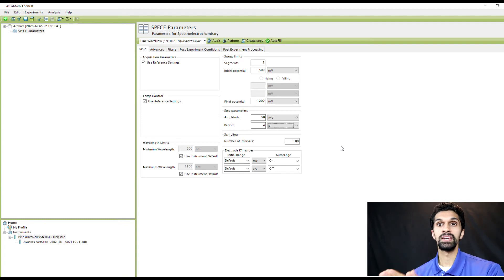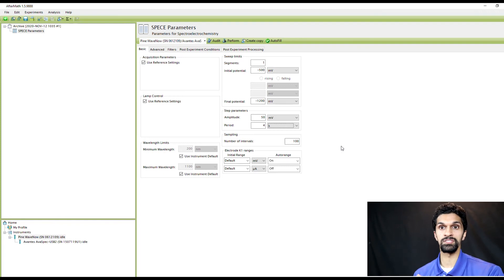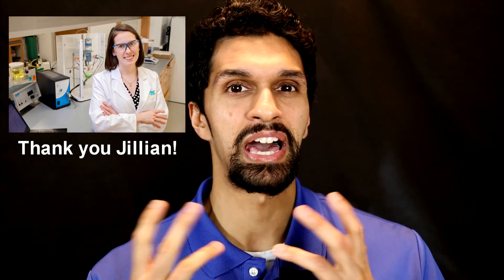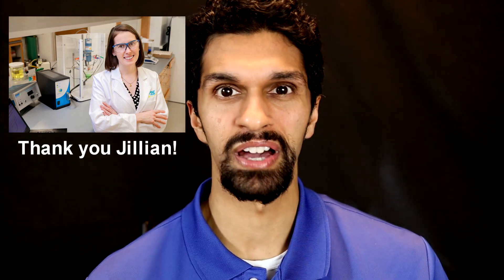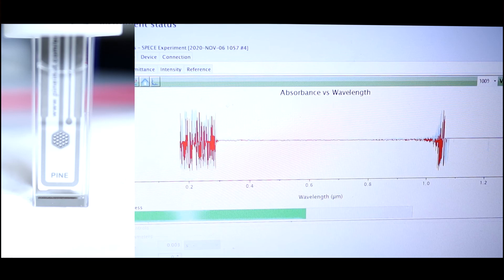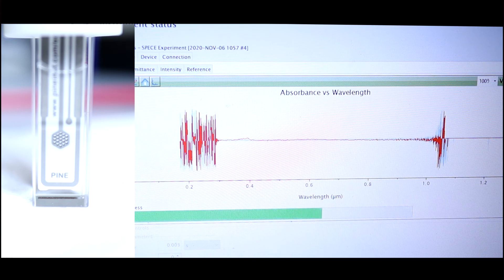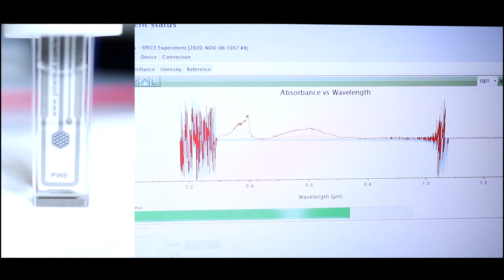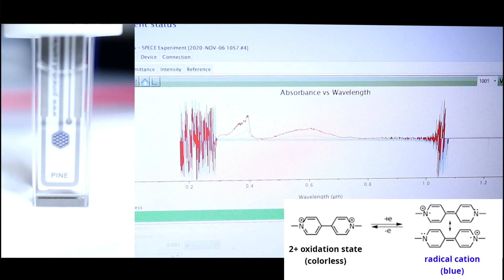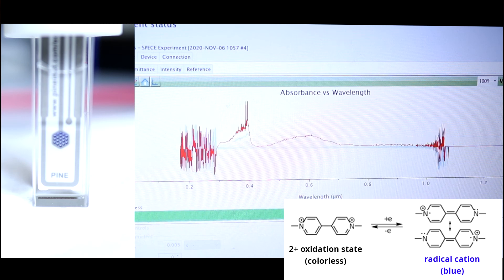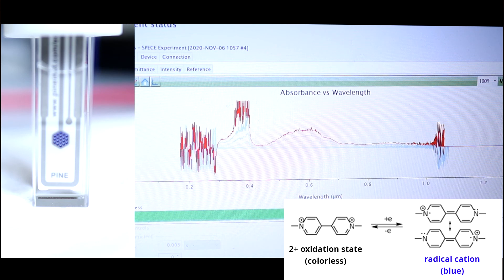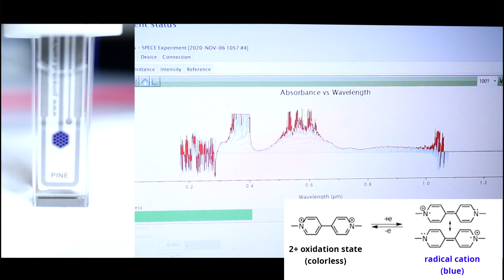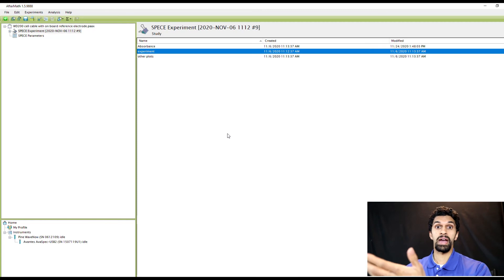I actually performed these methyl viologen experiments at the University of North Carolina at Chapel Hill in the Dempsey lab. Thank you Jillian for allowing me to use your lab as well as your methyl viologen. What I'm showing you now is side-by-side footage of the spectroelectrochemistry experiment in Aftermath as well as physically what's happening in the honeycomb electrode. As we start to reduce methyl viologen from the dication which is colorless to the radical cation which is blue, we physically see a blue-purplish color form in the honeycomb electrode and we start to see in the UV-Vis absorption this absorbance in the UV and the red which is giving it its blue color.